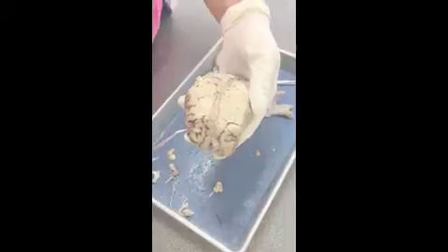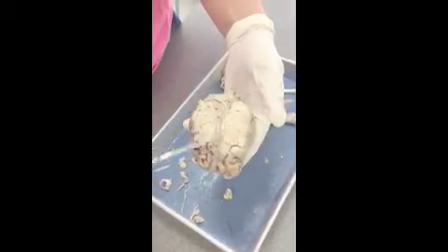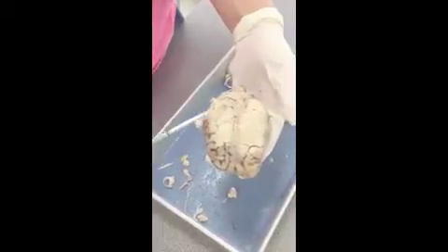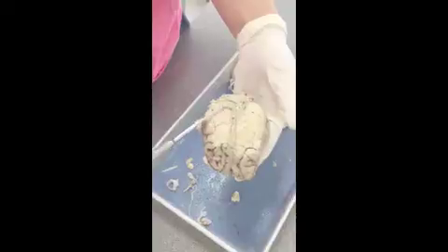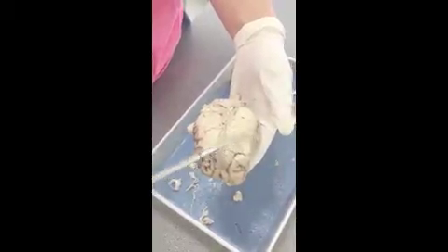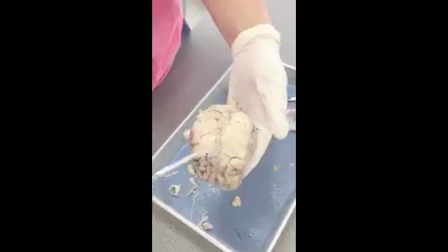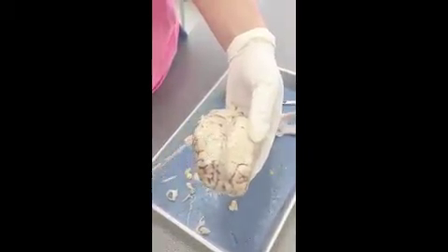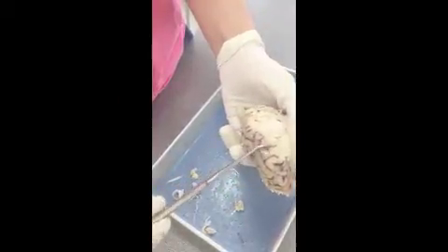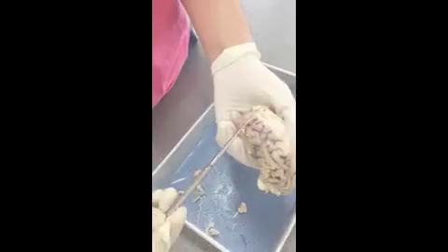Here is the frontal lobe, which controls movement, emotions, and reasoning. This is the parietal lobe, which controls movement, orientation, and recognition. And also the left and the right hemispheres. The right hemisphere controls creativity, and the left hemisphere controls language and logical reasoning.